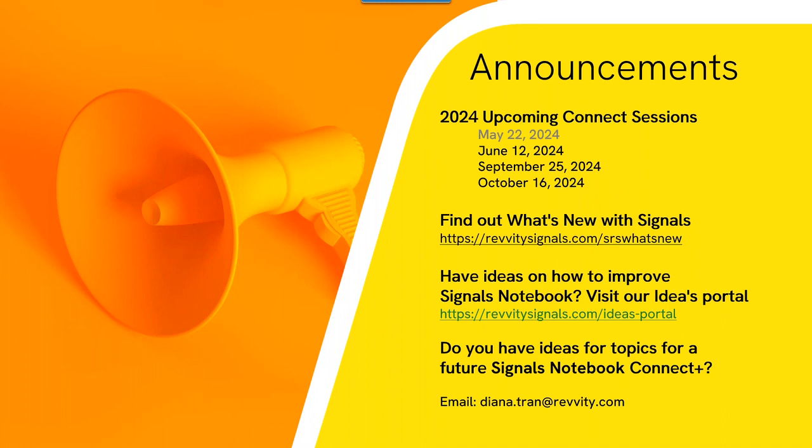Thank you. We perform a different flow FACS protocol than what you showed. Can Revvity Signals still support that? Yeah, so if I understand the question, we don't have the 11 steps. We have various other steps that we require. As I mentioned in the talk, no matter the flow instrument you have, we can work with the data that comes off of that. And then, from the analysis or normalization piece, we can generally support the majority of what you would be looking for without knowing in great detail exactly what you want.